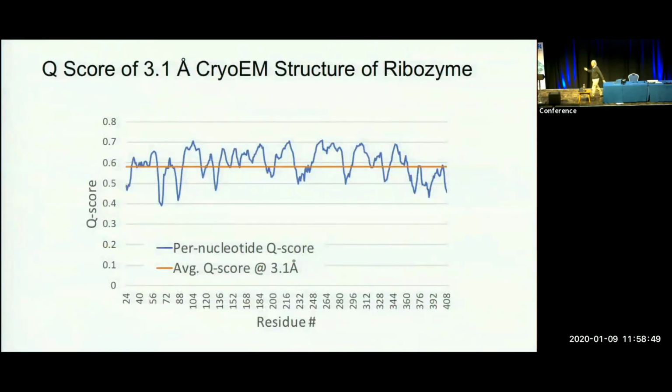So I think in the last few slides, I described the parameters that we think are useful to describe the resolvability between 1.5 and 2.5 angstrom resolutions. And as I pointed out, it is important to have the proper parameters to describe your map and model, and then with the statistical definition, not only for the whole structure, but at every individual atom, we are reaching that state.